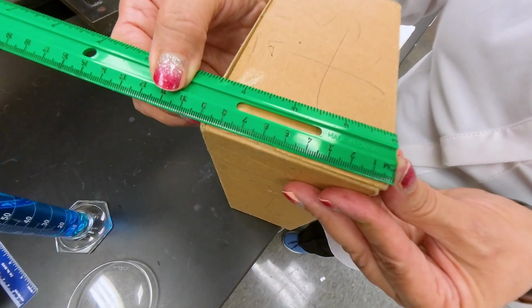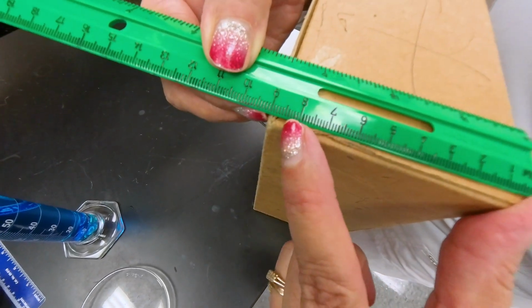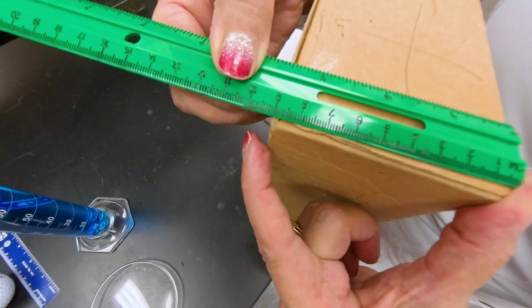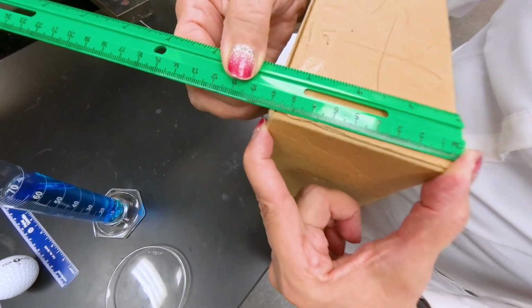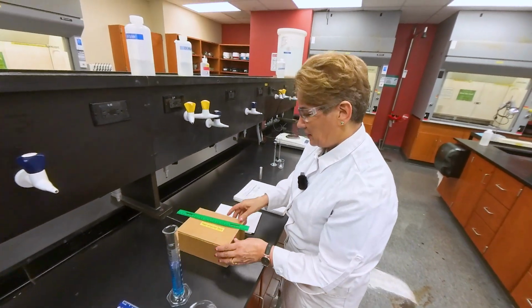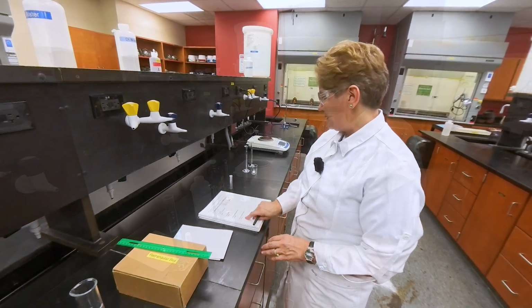The height is falling between 8 and 9, is 8.5, is between 8.9 and 9, 8.9 and 9, and you are going to estimate the last digit yourself. That's for measuring the volume of the empty box.